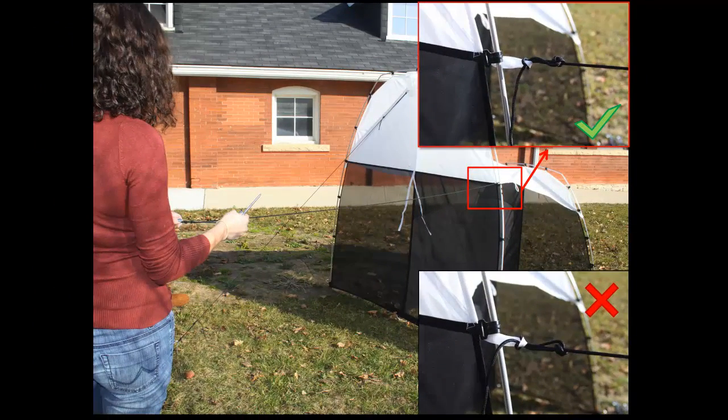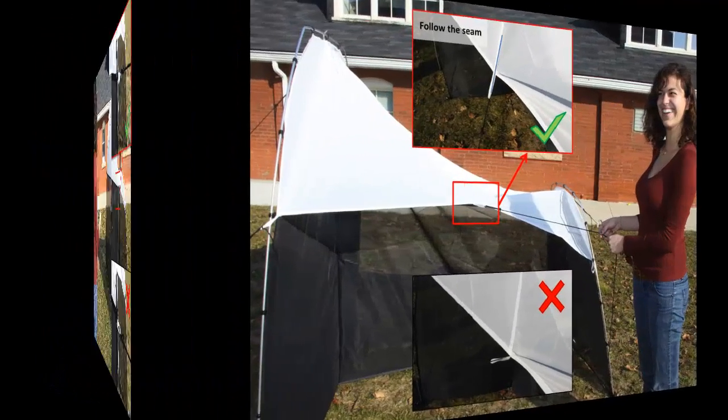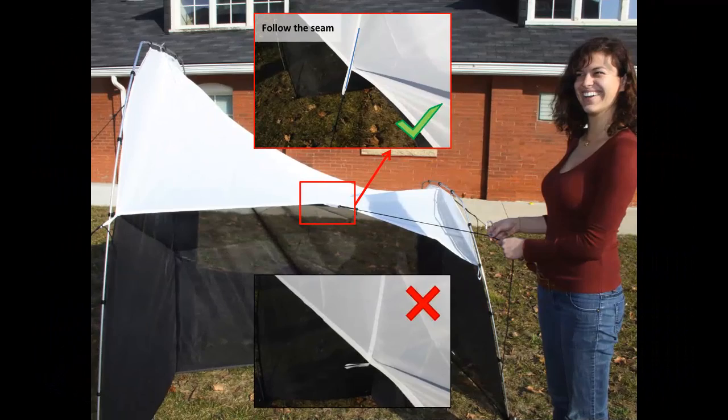Furthermore, notice that the rope loop should be wrapped around the outside of the pole, as opposed to under it. This just adds to the desired tension for the trap to stand secure. For the center ropes, follow the direction of the seam when pegging the rope into the ground.